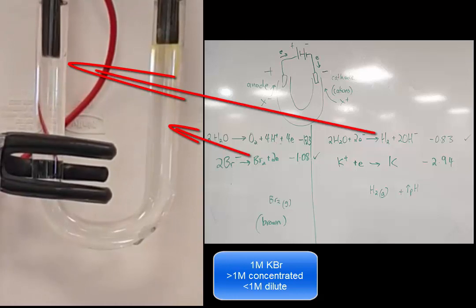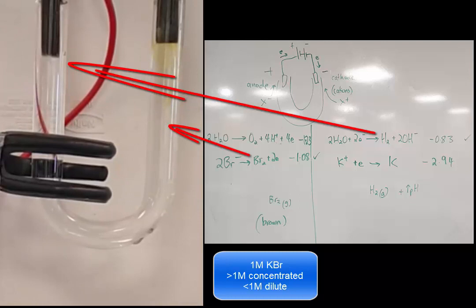And so you can also see the bromine, the yellowish color coming down on the right-hand side.